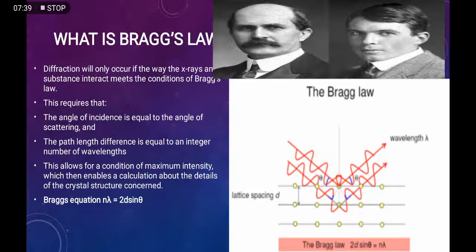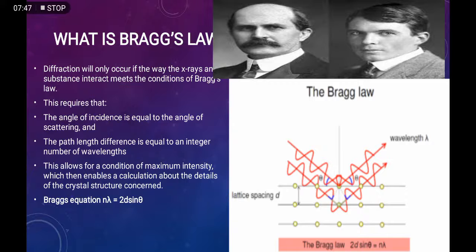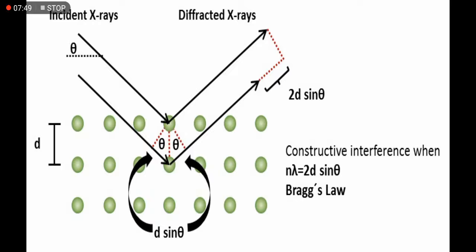In the most simplified form, a generic X-ray scattering measurement is shown here. Now here we will see that a beam of X-rays is directed towards the sample and the scattered intensity is measured as a function of outgoing direction. By convention, the angle between the incoming and outgoing beam direction is called 2 theta.